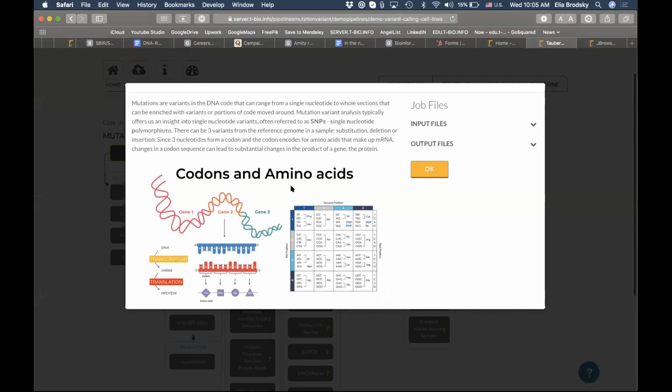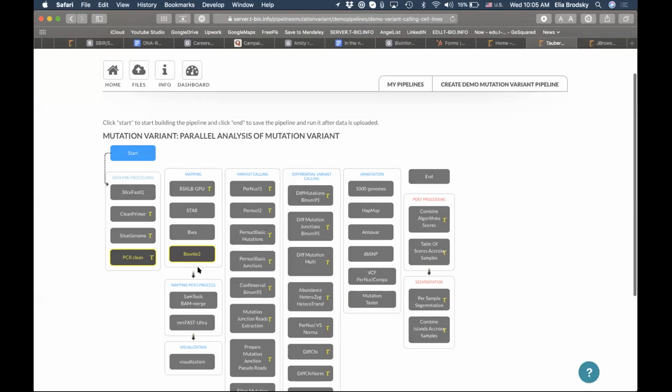So quickly, a question here, how to upload default FASTQ files. So this is a demo version, and then when we talk about actual processing of the data, you will use the non-demo accounts, and there are a few steps to configure before you actually upload. We are happy, maybe, to get on a call to explain how to use that. But to run the default pipeline, there's no need to upload anything. This is just a demo.